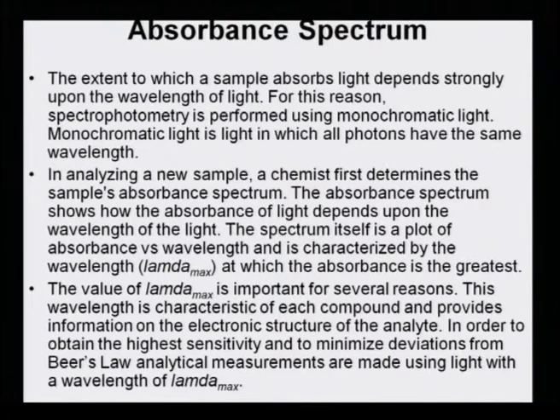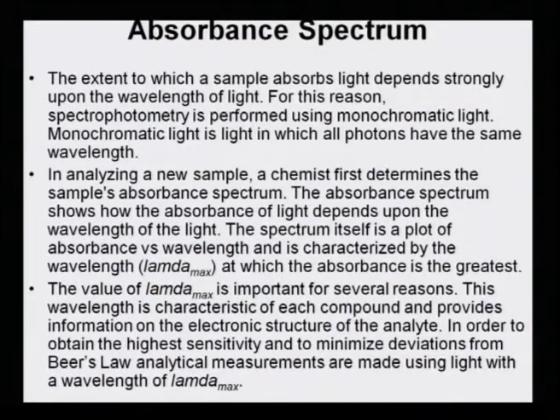So, when an absorbance spectrum is taken for the analyte, it is simply qualitative information whether or not any functional group or chromophore is present which can get excited by this incident light. The spectrum itself is a plot of absorbance versus wavelength and is characterized by the wavelength lambda max at which the absorbance is the greatest.